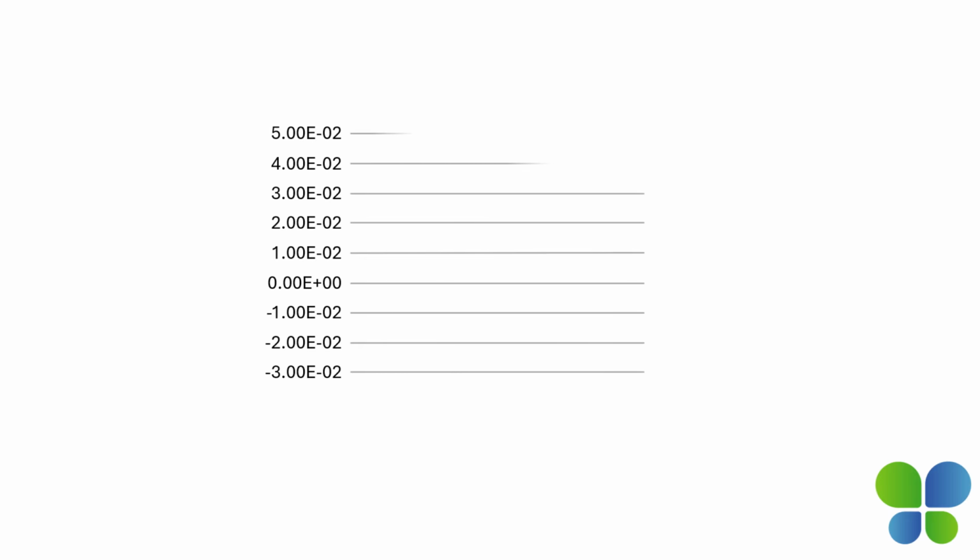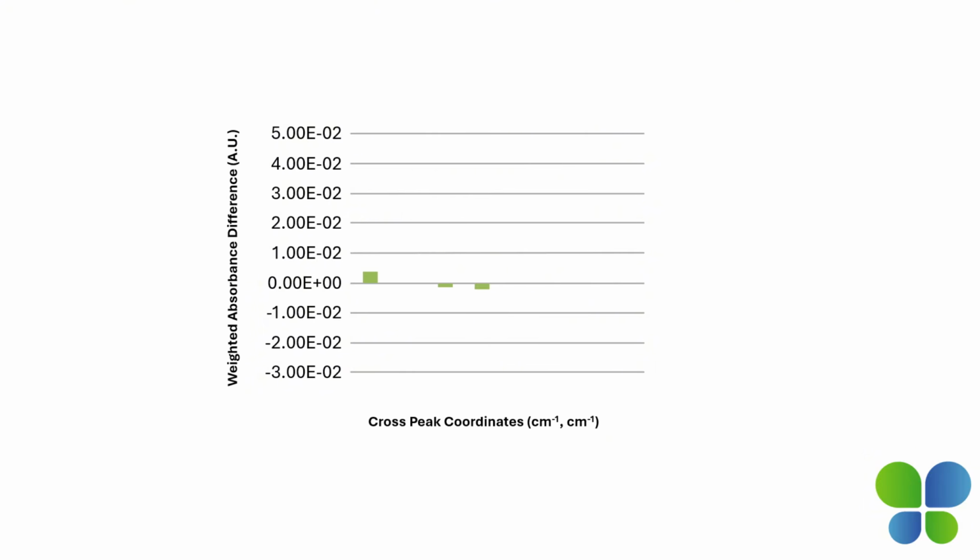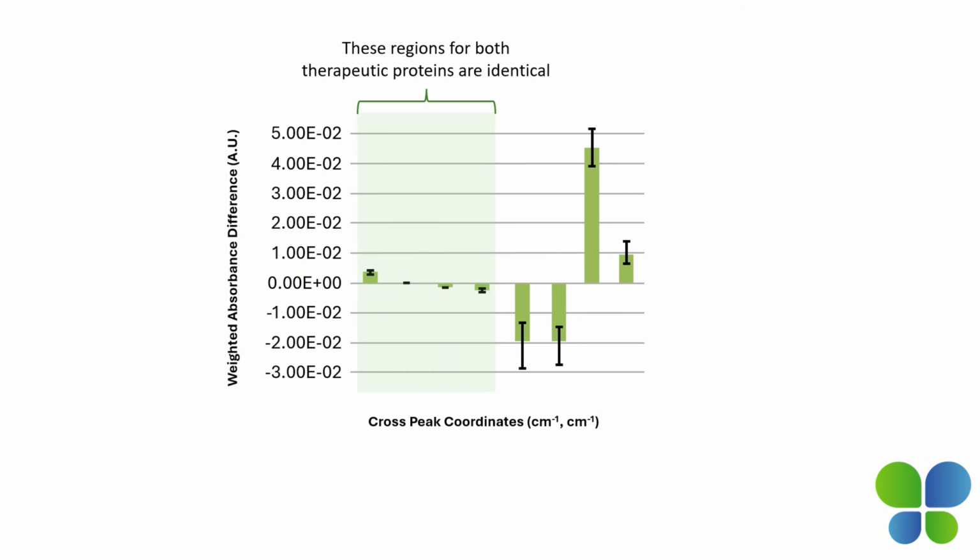The results can be interpreted using bar graphs, where positive values indicate regions of the first sample protein with greater content for the specific contribution, and negative values represent other regions where the second sample has a greater contribution. These bar graphs also inform which sample has a greater contribution when compared to another sample, or a reference standard in the same slide cell array. Contributions may be associated with the secondary structure, amino acid composition, SASA, or glycan profile.